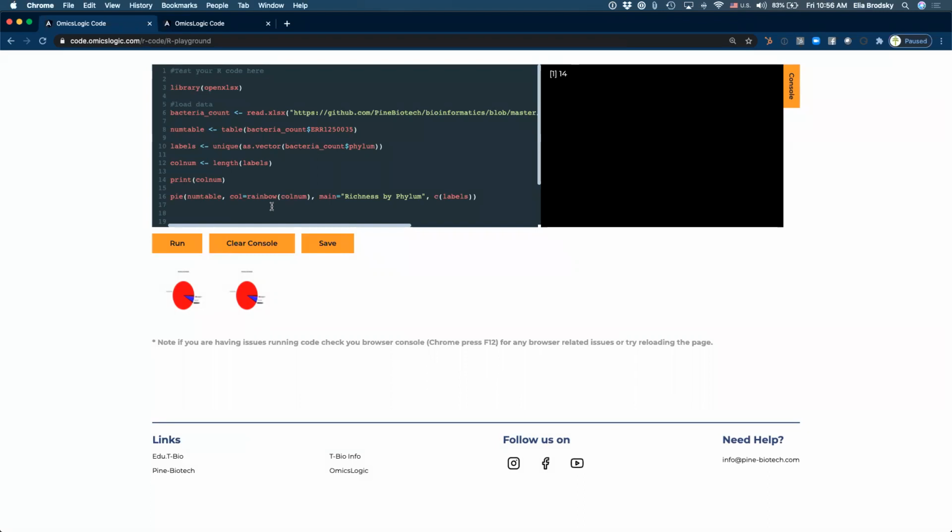The one thing that we need to do is make sure that we are actually getting the right numbers. So this will be your assignment for next time. Next time, we will pick it up from here and go through the full code, and try to compare several different samples between themselves to understand how we actually measure differences between samples.